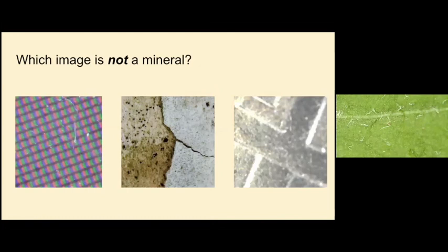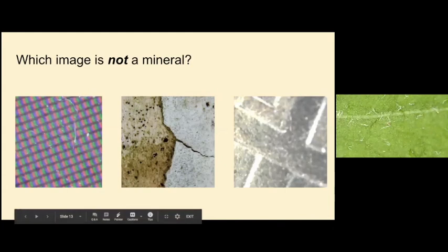Even my robot's confused. I can't even figure it out. I know, it's so hard. Oh yeah, Fern, do you have something? I think the third one might actually be metal. Oh wow, it does kind of look like metal. It's shiny, right? That's a great observation. Nippon wants to know what it is.